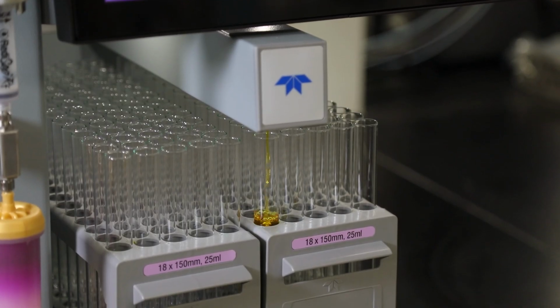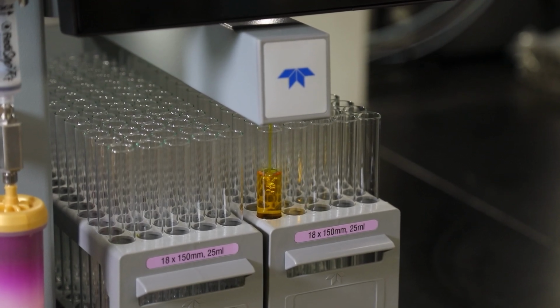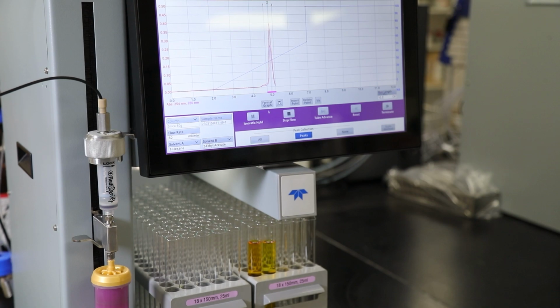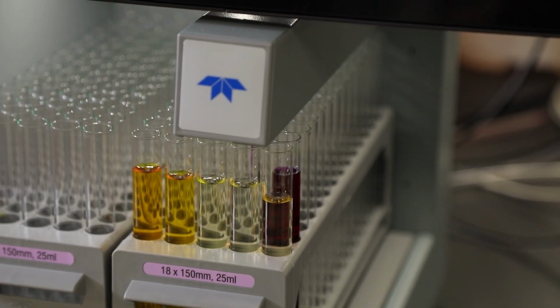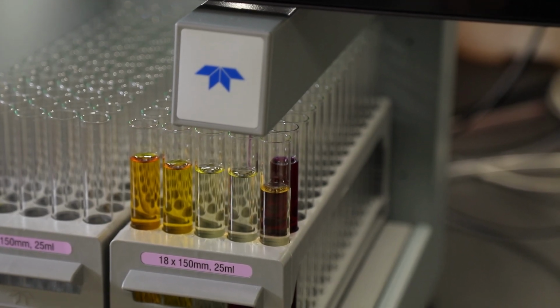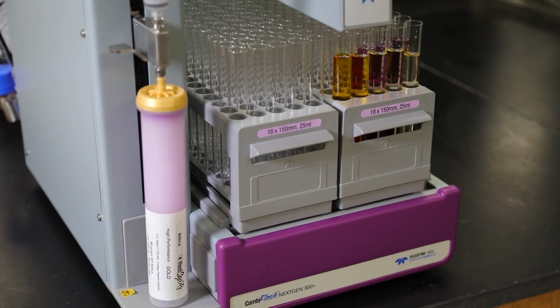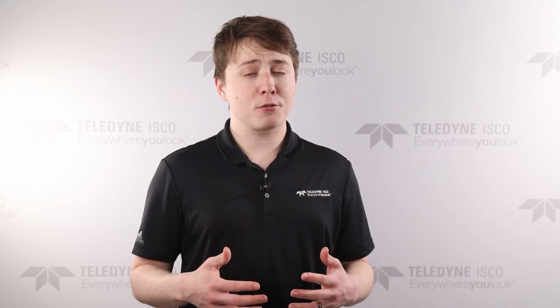The UV signal is also used to trigger fractionation in test tubes using a fraction collector. When the machine sees a peak in UV, it causes the fraction collector to move to the next tube. Since each compound is isolated in a different tube, when the solvent is evaporated, all that's left is the compound you're trying to isolate. That isolated, purified compound can then be used for developing and manufacturing foods, pharmaceuticals, and many other things.